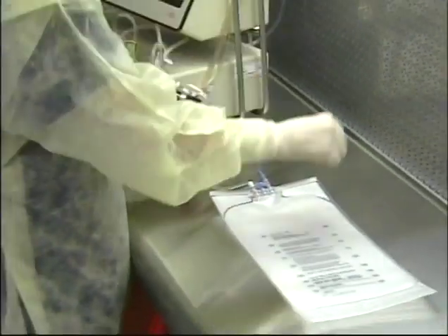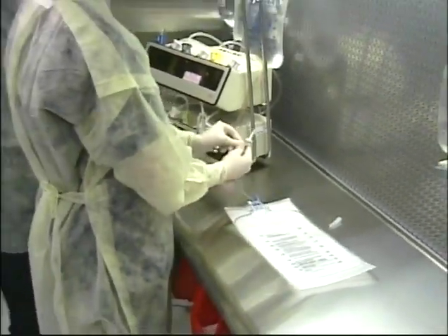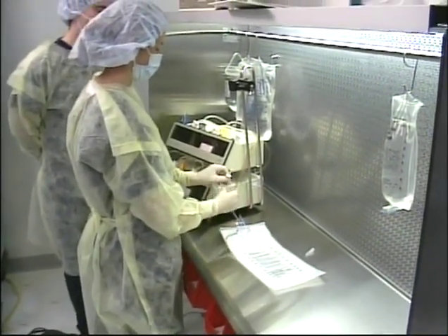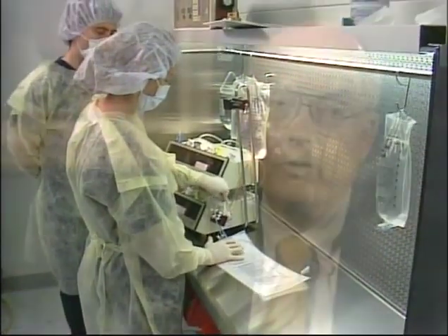In today's very crowded pharmacy curriculum, with its understandable emphasis on clinical subjects, little, if any, time can be allotted to quality assurance topics dealing with the dispensing of injectable products. However, it is imperative that each hospital pharmacy establish a robust, consistent, overall quality assurance program. Too often the programs that do exist are not the kind they should be. Not because practitioners don't want to do it right, but because they don't have the necessary skill sets.